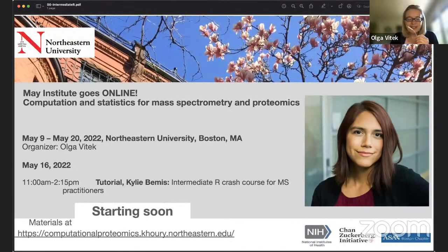But before we go there, today we spend one more day on R, and our focus is on working with R after we already have some experience with just reading the data, writing some simple scripts, and so on, so that we can start getting closer to not just doing some analysis, but doing analysis in a manner that is reproducible and reusable and usable for more than one project.